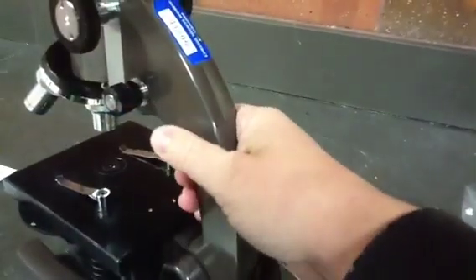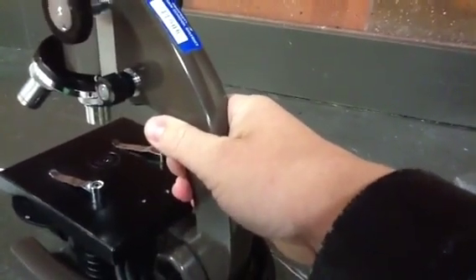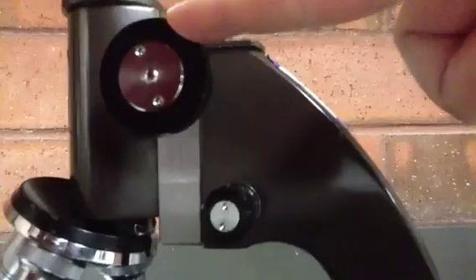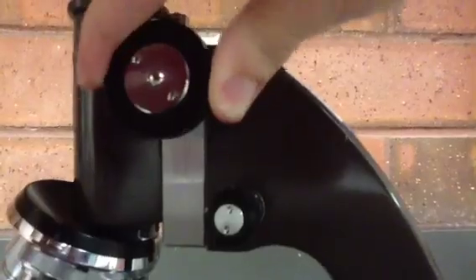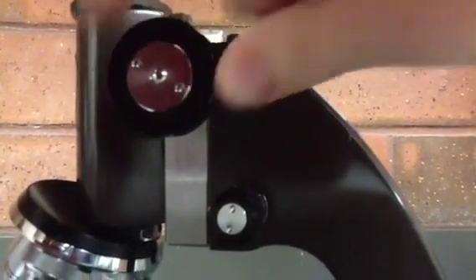This piece is called the arm. It's used to support the microscope when it's being carried. This is a safe place to grab the microscope so that it doesn't get damaged. This part is called the coarse adjustment knob. This is used to focus your microscope. If you turn the knob, it moves the stage up and down, which allows you to focus.